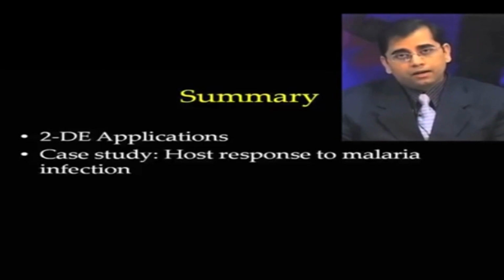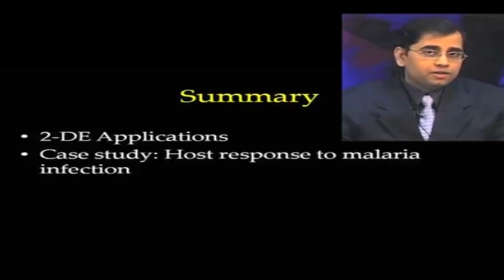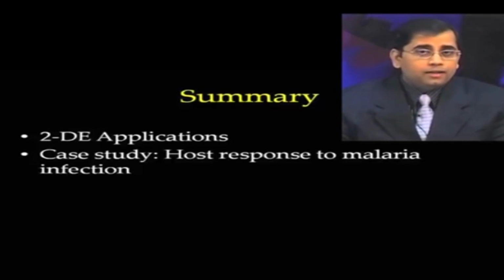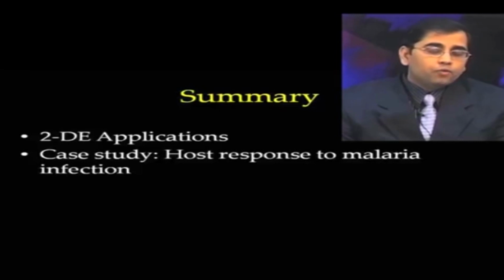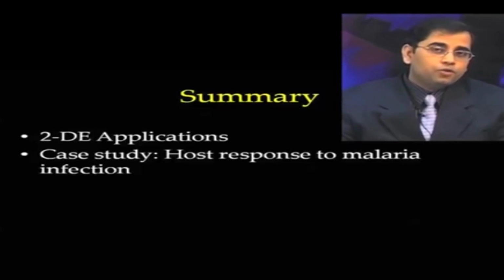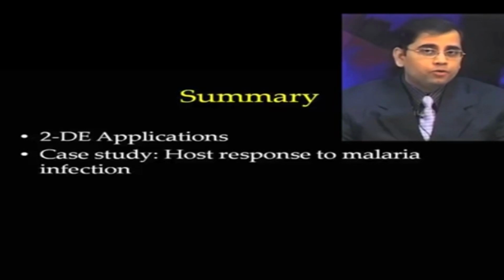If you can increase the overall proteome coverage and separate over 1500 to 2000 proteins on the gel reproducibly, then you have a good chance of identifying various potential targets, which could be novel drug targets or potential biomarkers. But if you have not done the proper quality control experiments, have not optimized the protocols properly and your proteome coverage is very poor on the gel, then you are comparing only a partial proteome, and there is a good likelihood that you will miss many important changes.